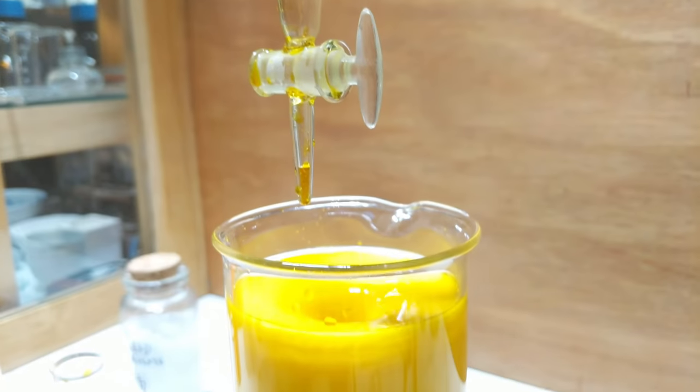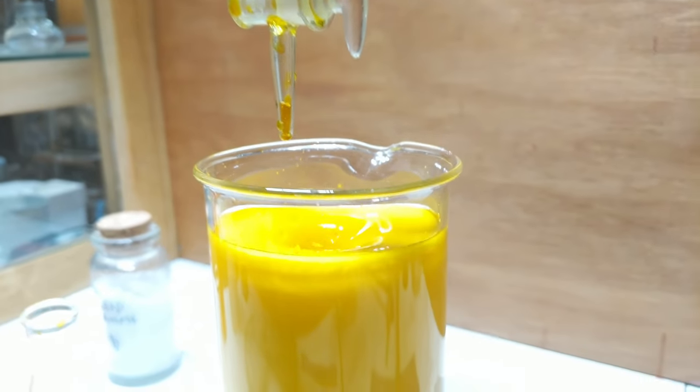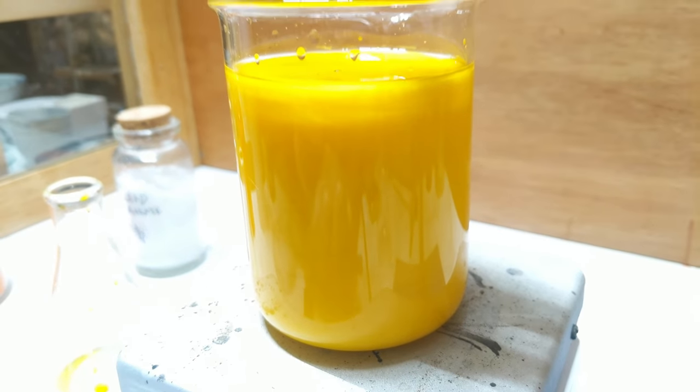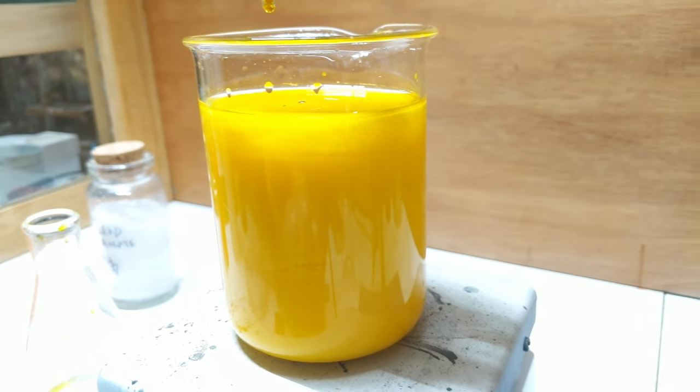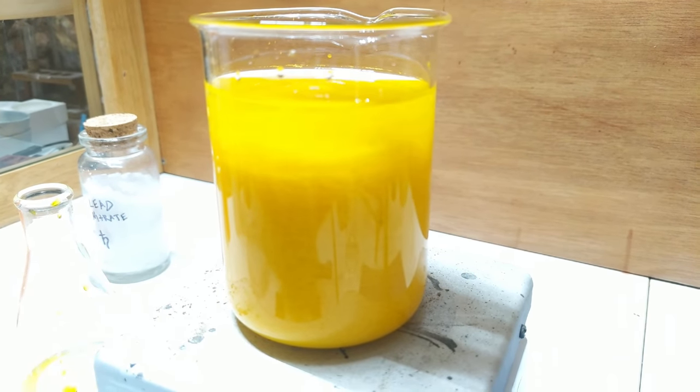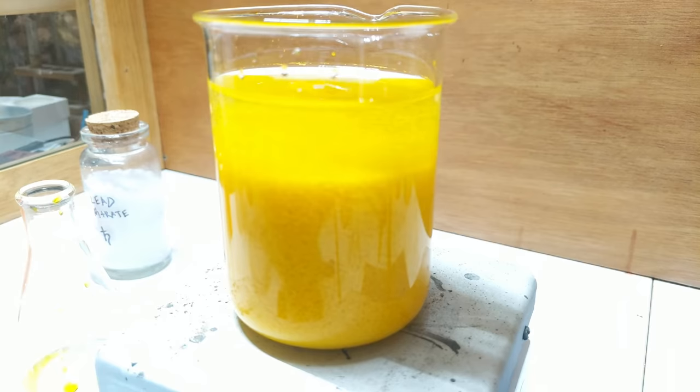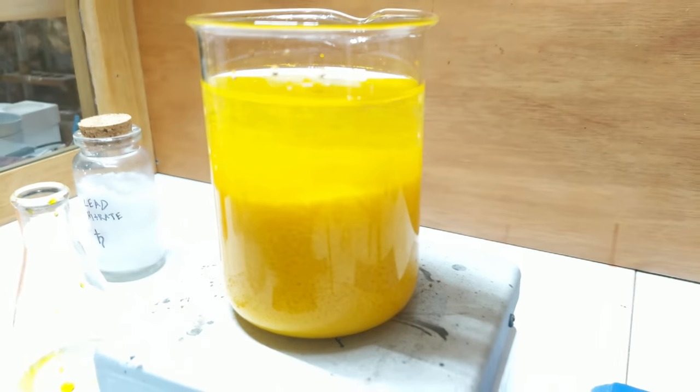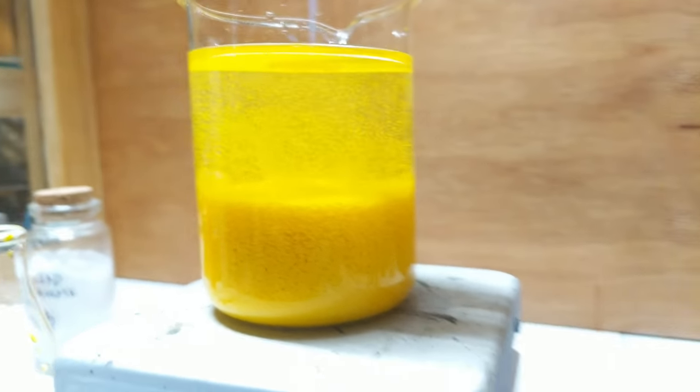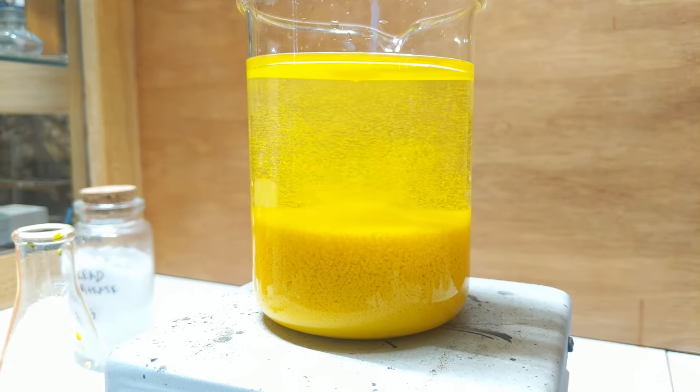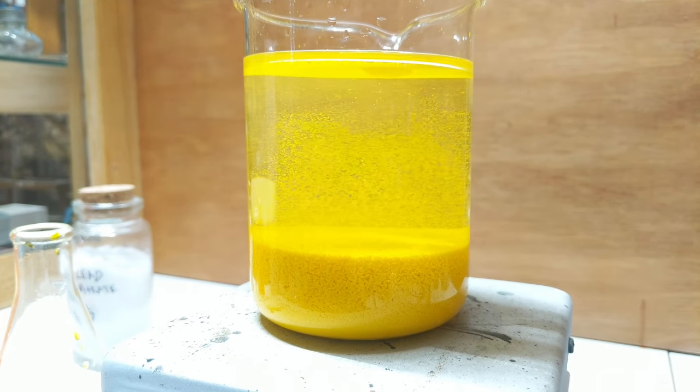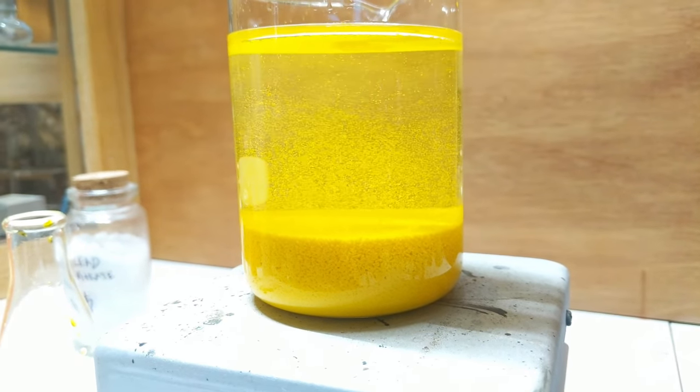So now all of the chromate solution has gone in, and as we stop the stirring, you can see all the precipitate. And the lead, being lead, is heavy and wants to settle out very quickly. So you can see it there, settling down the bottom. Beautiful.